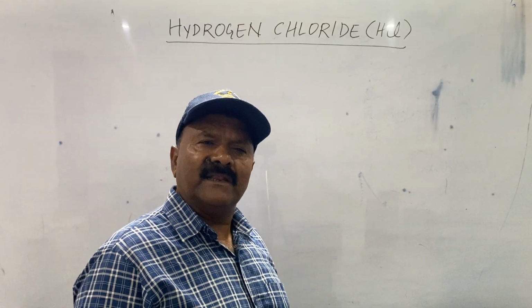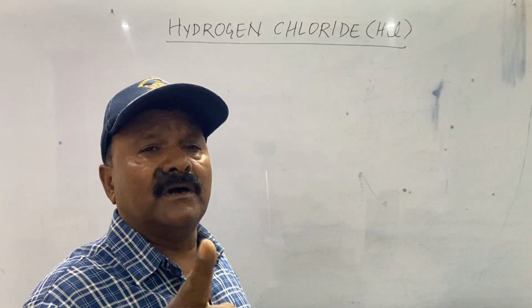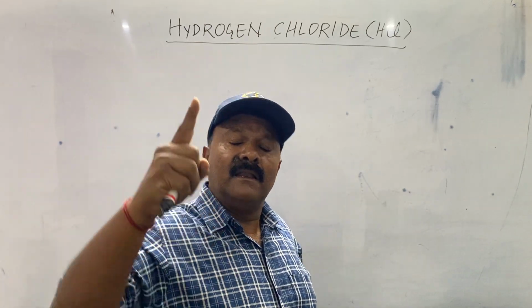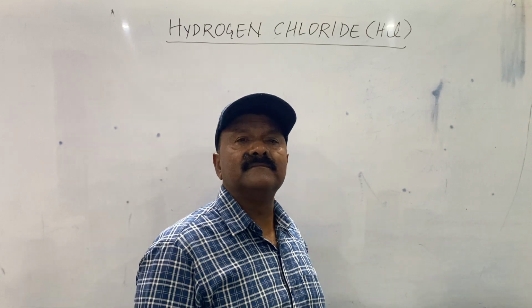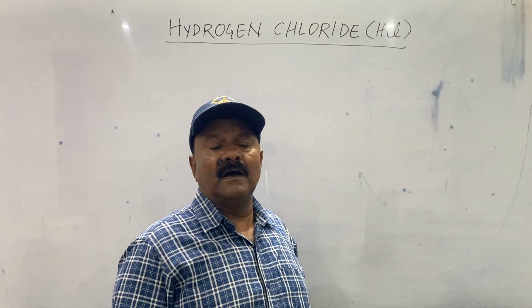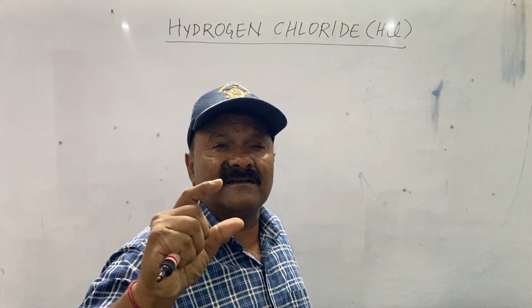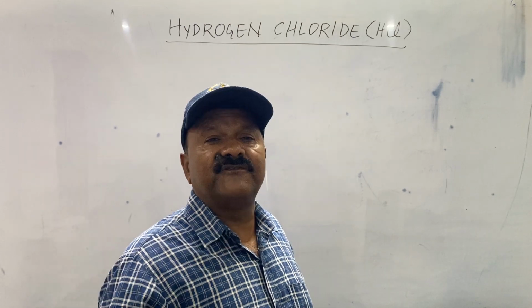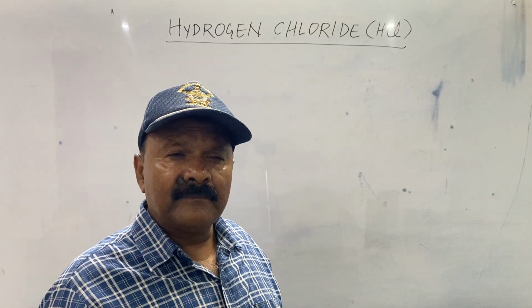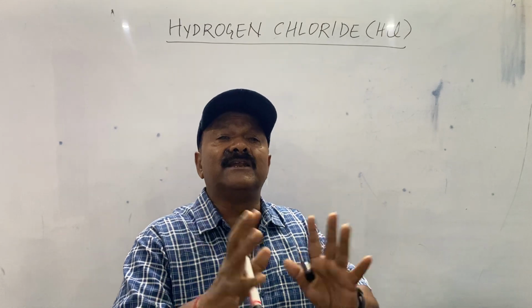one must keep one thing in mind, that the temperature should not be more than 200 degrees Celsius. We have to maintain the temperature less than 200 degrees Celsius. Yes, less than 200. Otherwise, what will happen? It will form a thick white crust at the bottom of the flask, which will be very difficult to clean after the reaction, and while cleaning, the flask is likely to break.